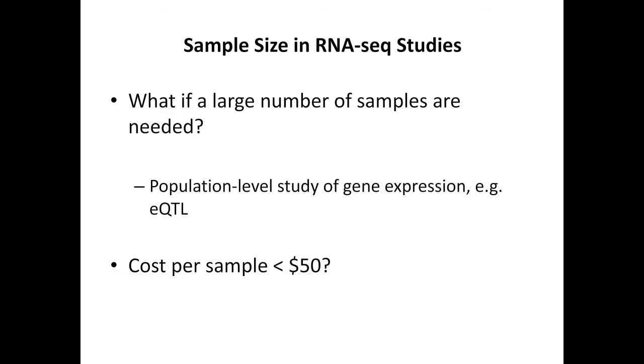When we need a large number of samples sequenced, for example, in population-level studies of gene expression, and for those of you familiar with eQTL analysis, we need maybe 500, 600, sometimes thousands of samples. So the question was how we could do RNA-seq on a large number of samples, and whether we can reduce the cost to $50 per sample.